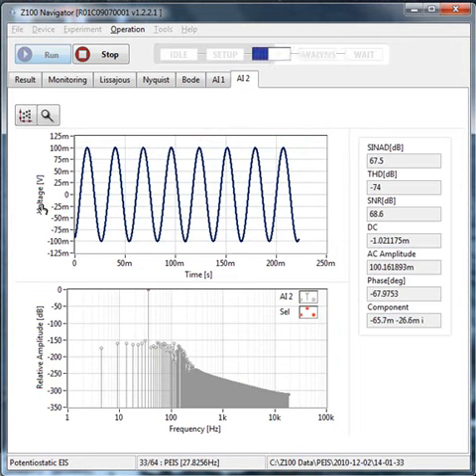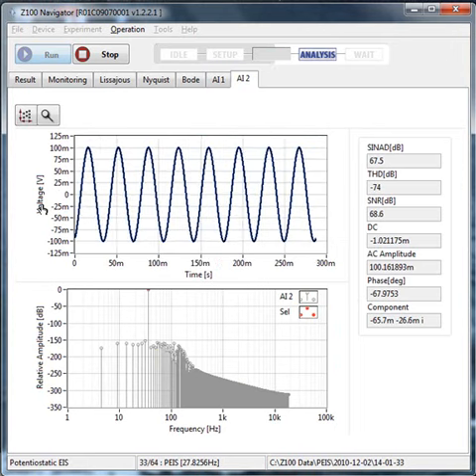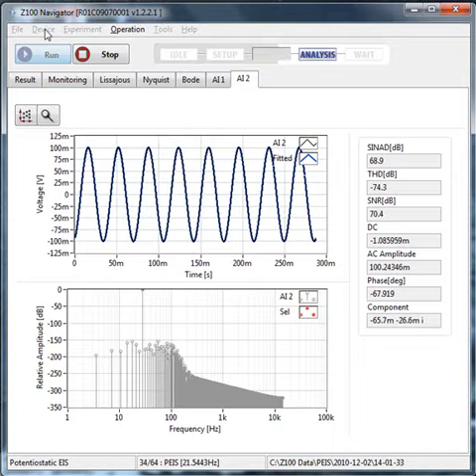The loopback test confirms that the system is working properly. Once it's finished, you should remember to disable Loopback in the device menu.